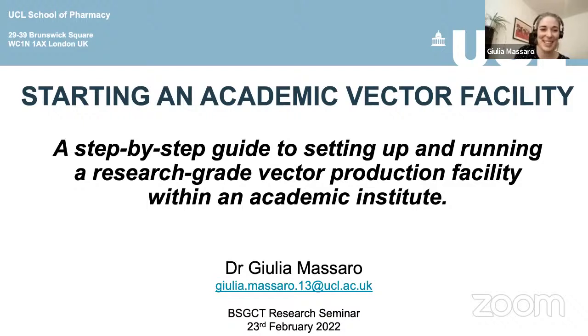Thank you very much. Thank you for the introduction and thank you for inviting me. As said by Rebecca, today I'm going to talk to you about how we started this VectorCore. This is a research academic VectorCore facility, and I'm going to talk to you about how we came about with the idea, what funding is needed, and how to set up in general and manage a vector production lab.